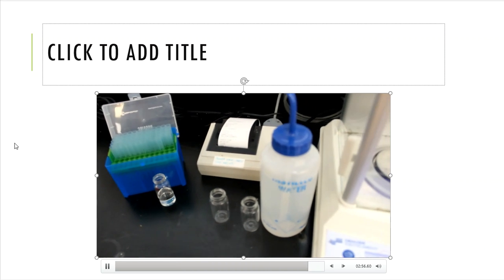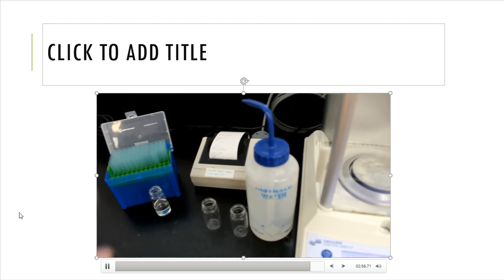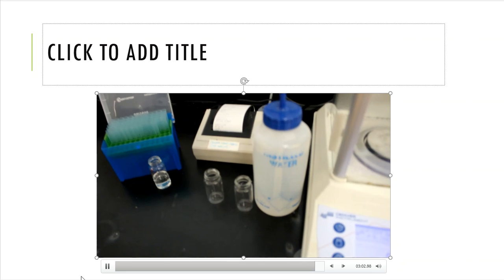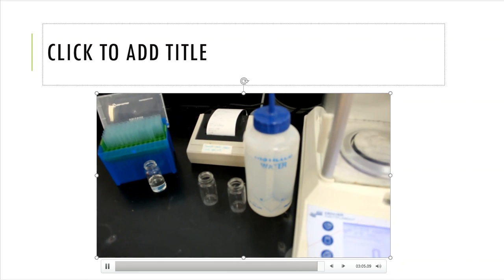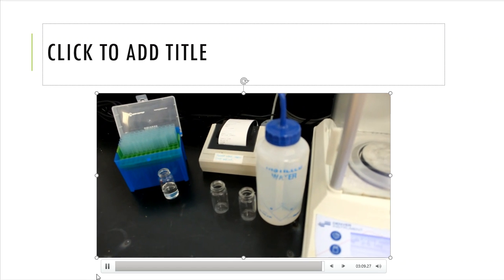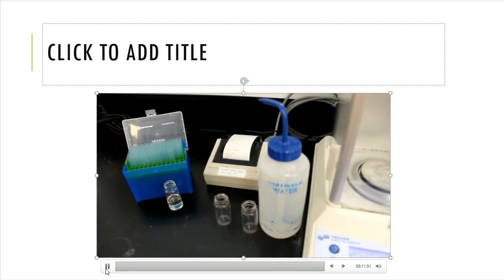All right, so there is the micropipette density setup. I'm going to take a few pictures of this process so that you can see my measurements and the readouts on the balance. And then after that, you'll have the density part B finished for the lab experiment.